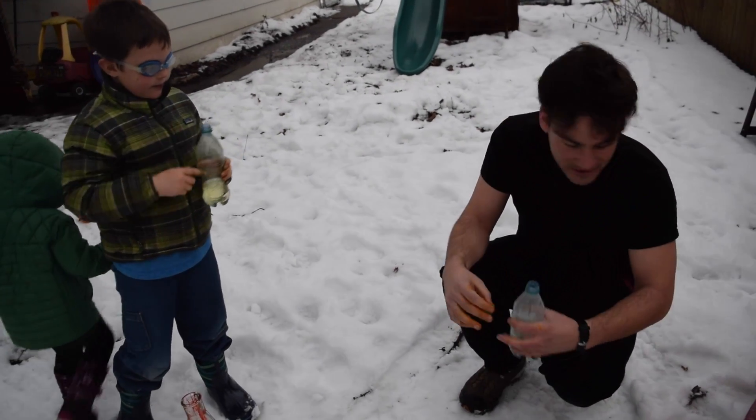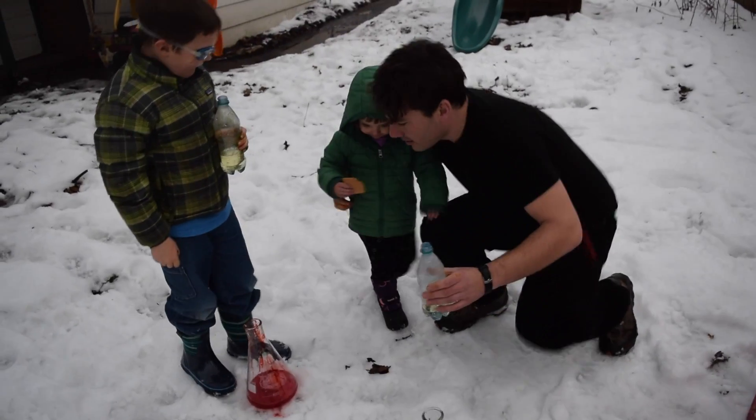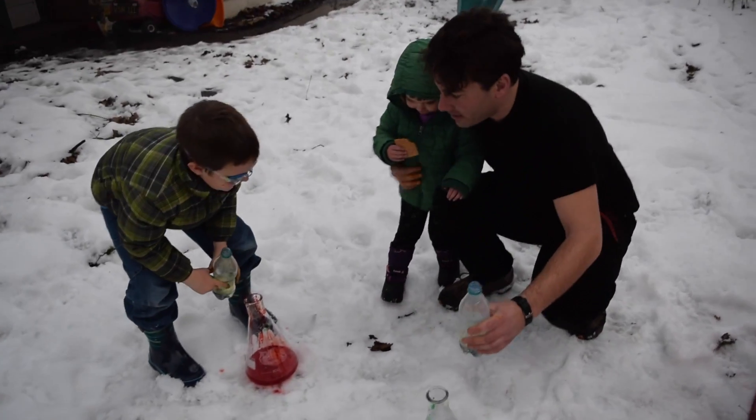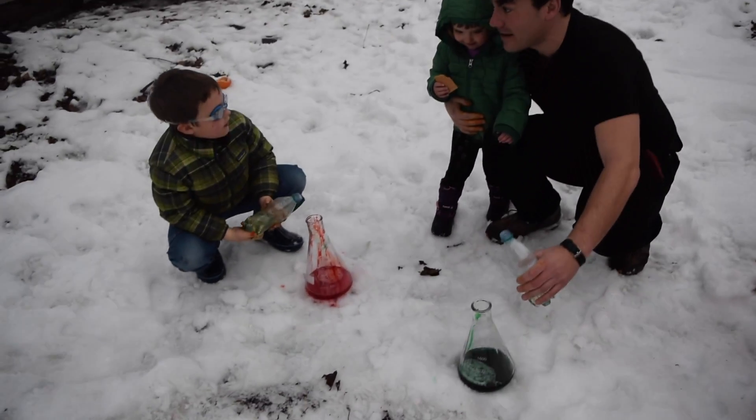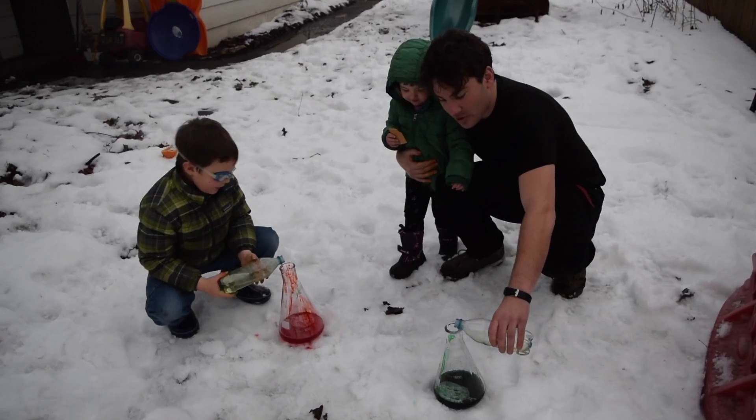I already unscrewed mine. Okay, you unscrewed it — let's wait to pour it in. Do you want to come over here? So we're going to pour it in. We're going to count to three, pour it in really fast, and then back up. All of it in really fast. Ready? One. One. Two. Three.